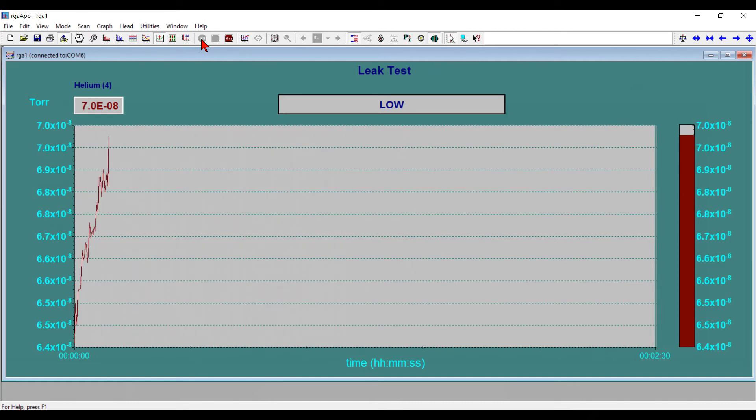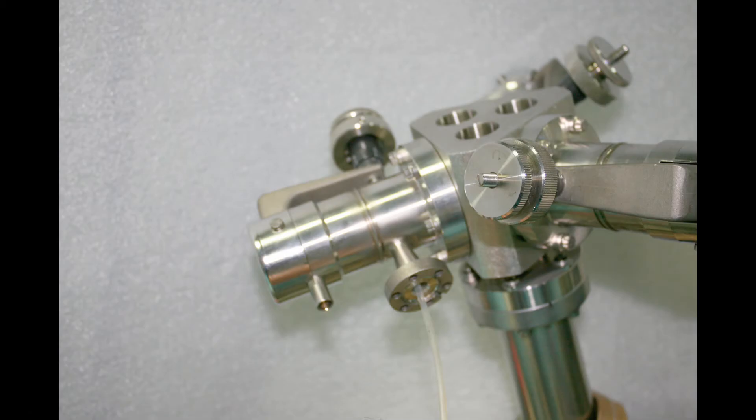We see the helium peak is increasing slightly — this is just from the filament warming up. It's not due to putting helium on the outside of the chamber because we haven't done that yet, but it does give us a baseline. Now we'll inject some helium into the inlet of this Baizer's leak valve.